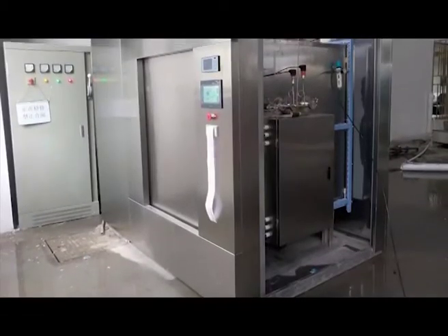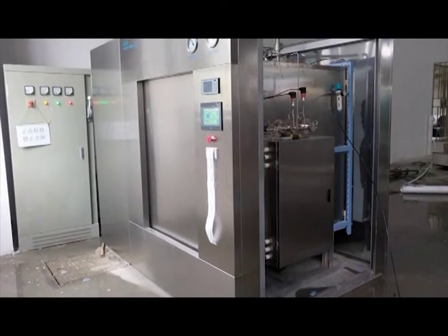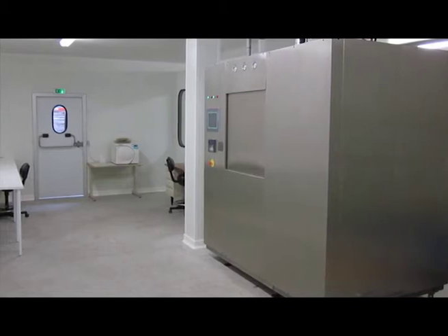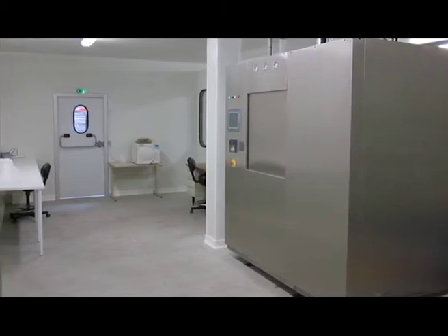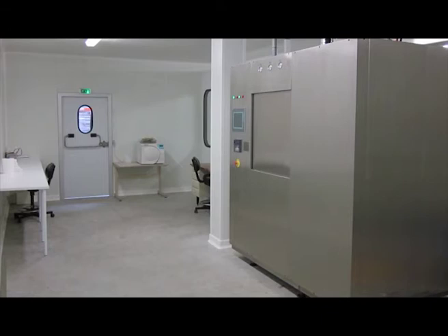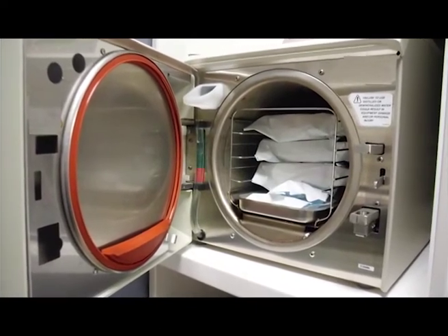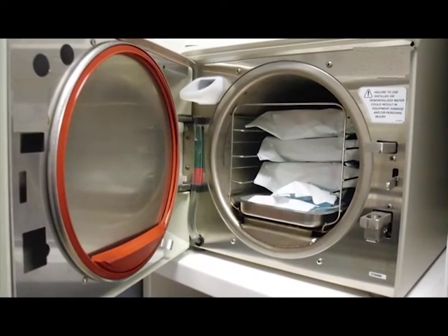The sterilizing medium is saturated water vapor which transmits thermal energy by condensing on medical products. Steam sterilization is a relatively older technique and can be carried out easily using standardized equipment and without using any hazardous material. Yet a sterility assurance level can be achieved. The equipments used are autoclaves like downward displacement, vacuum assisted, pulsed and steam dilution. The conditions are 121 to 134 degrees centigrade at high pressure.